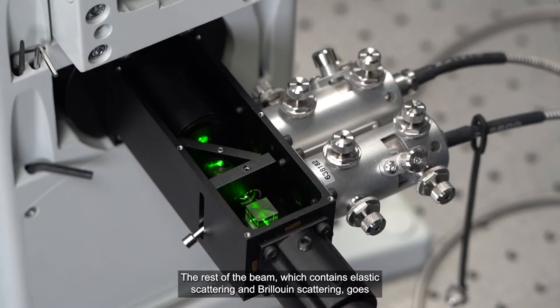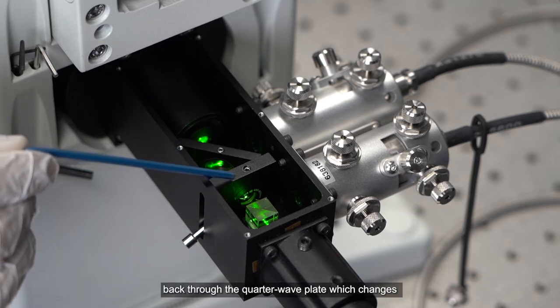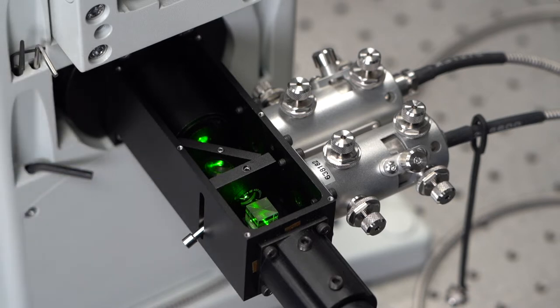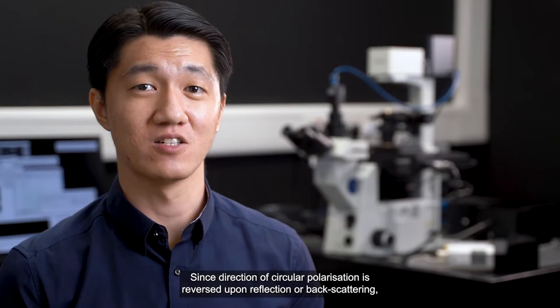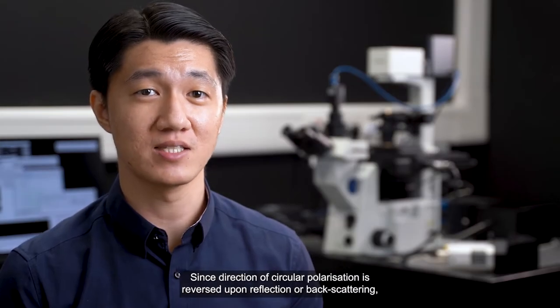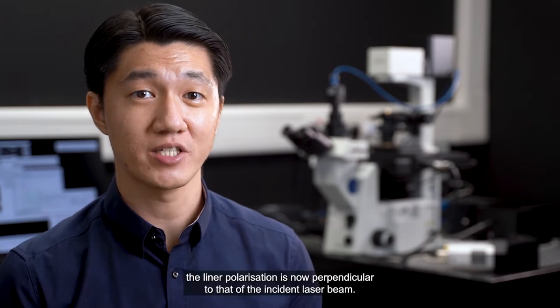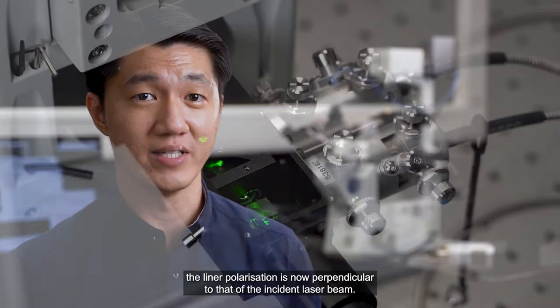The rest of the beam, which contains elastic scattering and Brillouin scattering, goes back through the quarter-wave plate, which changes circular polarization of the beam to linear polarization. Since direction of circular polarization is reversed upon reflection or backscattering, the linear polarization is now perpendicular to that of the incident laser beam.